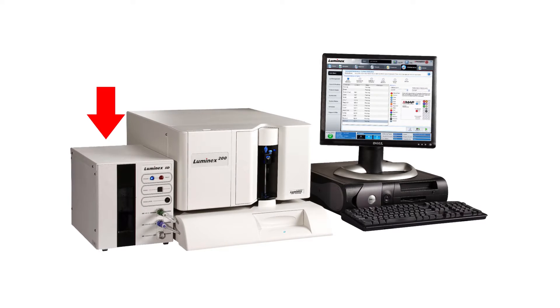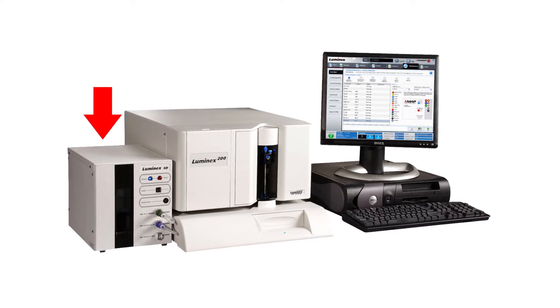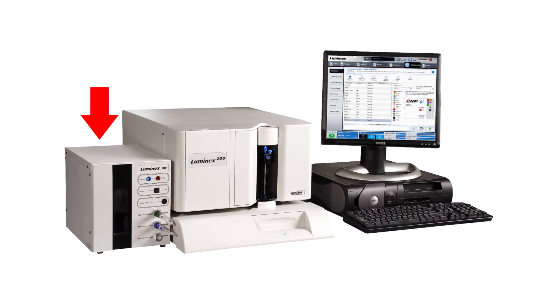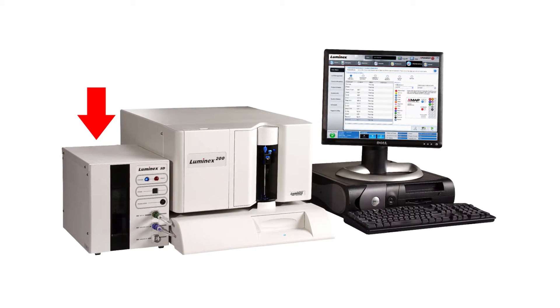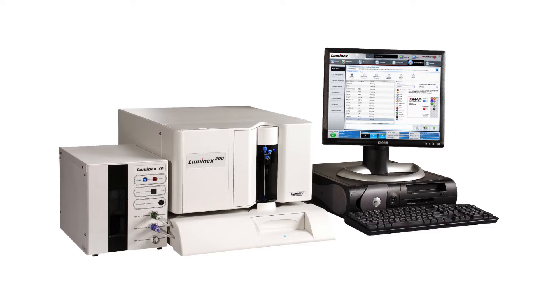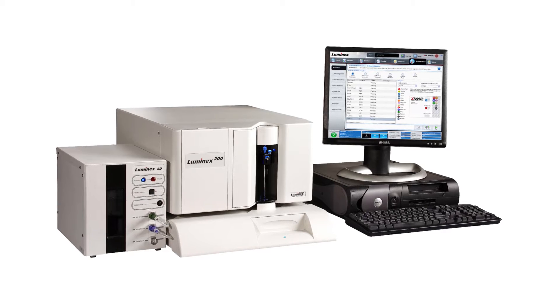The Luminix Sheath Delivery System, Luminix SDS, is used with the Luminix 200 instrument.